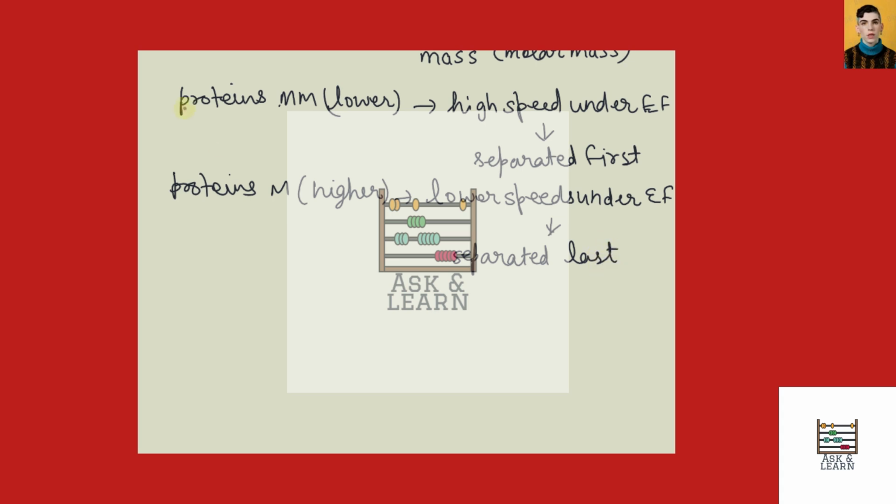So this is how both these two technologies are used for separation, or we can say purification of proteins.